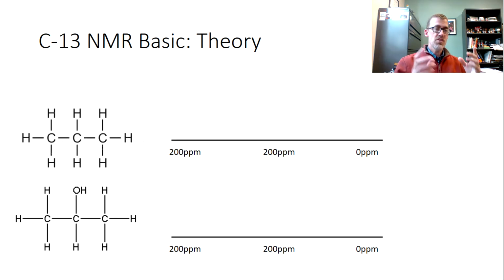However, if you put a solution of material inside a very strong magnetic field, it'll force those nuclei to all line up with that external magnetic field. So now, instead of all your nuclei doing some basically random motions, they're pretty much all aligned and ordered and organized. So inside a magnetic field, the nuclei want to line up with it, and that's what we will consider the ground state.